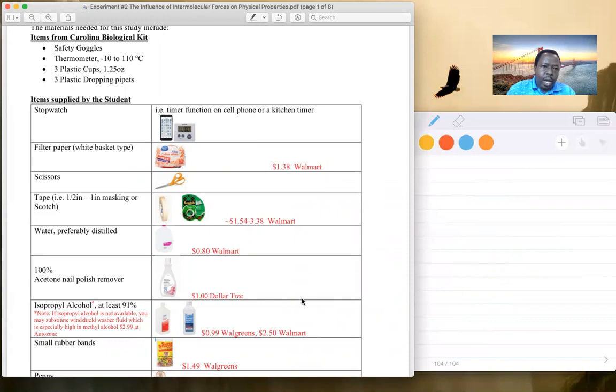you should have safety goggles, all right? The thermometer, you should have received that. Mine is slightly different, but I think there is a smaller one, all right? This is one I do have in my office. I'm in my office right now. And I think yours should be a small one. You should have received something similar to this, and there is a thermometer in its storage. You can see that, all right?